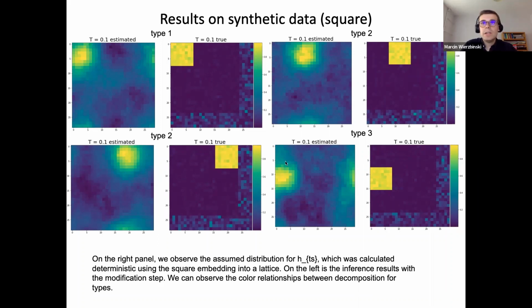So it means that our squares can infer the information from the synthetic data, the Celloscope model.